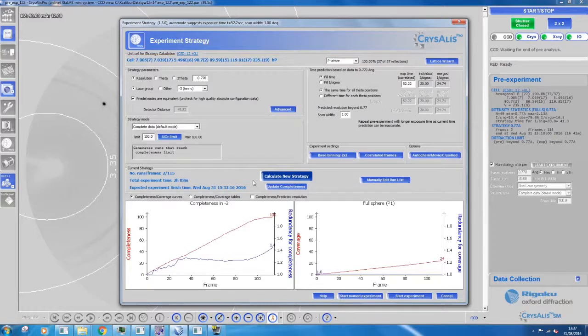If you are collecting data for a chiral compound, untick the Friedel mates are equivalent box. Look at the total experiment time and check that it is suitable.